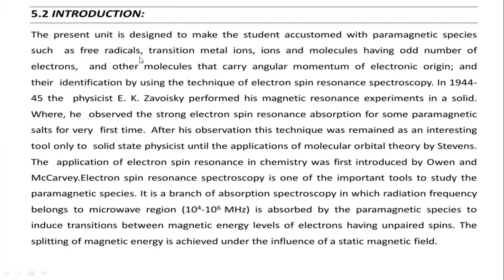In 1944-45, physicist E.K. Zavoisky performed his magnetic resonance experiments in solids, where he observed a strong electron spin resonance absorption for a paramagnetic salt for the very first time. After his observation, this technique remained an interesting tool only in solid state physics.